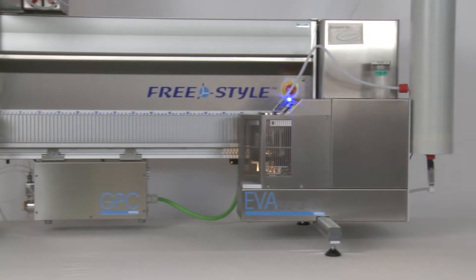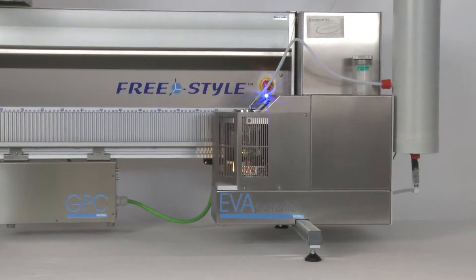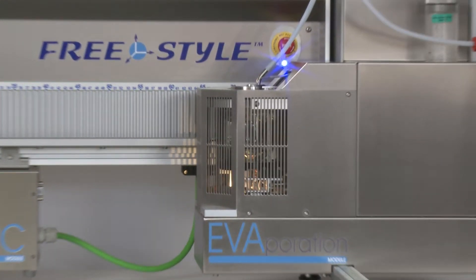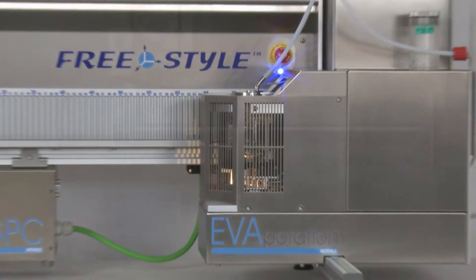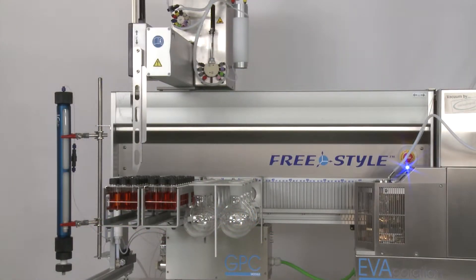The GPC becomes especially convenient and efficient in combination with the automated online evaporation module. Using the example of a Chile sample, we would like to explain the sequence of a GPC sample cleanup.